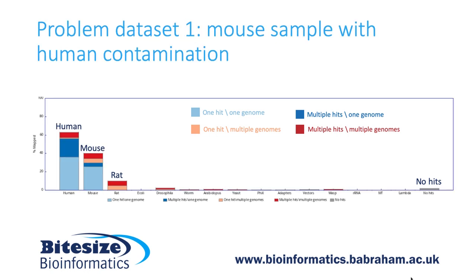Okay, so we've seen a good sample, so what might a bad sample look like? Well, I'm going to give you a series of different data sets now that we encountered over the years, and I'm just going to talk through with you the type of problem we're seeing, what type of artifact we're looking at and how it may have been generated.